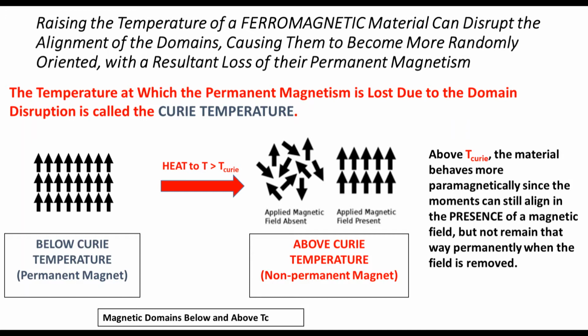To recap, below the Curie temperature, the atoms are aligned in parallel, causing spontaneous magnetism. The material is ferromagnetic. Above the Curie temperature, the material is paramagnetic, as the atoms lose their ordered magnetic moments when the material undergoes a magnetic phase transition.